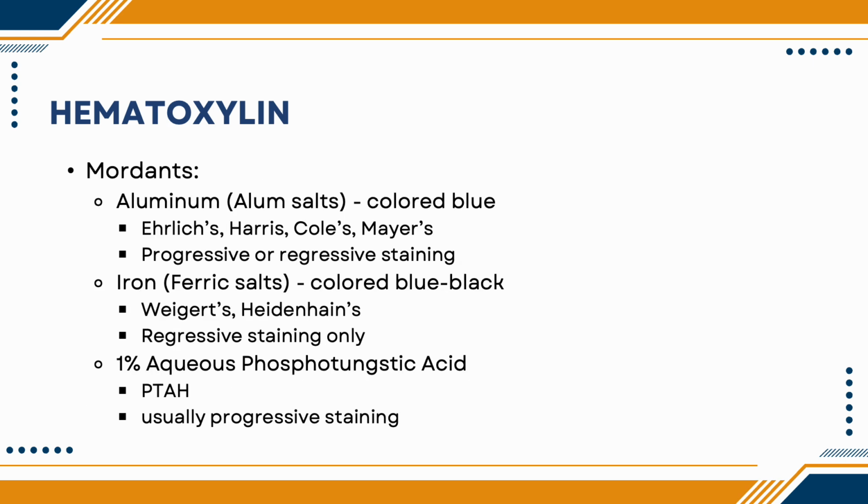So here are variations of hematoxylin according to the mordants being employed. So before we move on to mordants, I want you to have a better understanding on what mordants are. So let's say for example, this is your hematoxylin. Hematoxylin would not bind with tissue. Let's say that this is your tissue. Bakit hindi siya mag-bind? Because the hematoxylin would require mordants in order to facilitate the binding of the stain to the tissue. So, how does a mordant work?